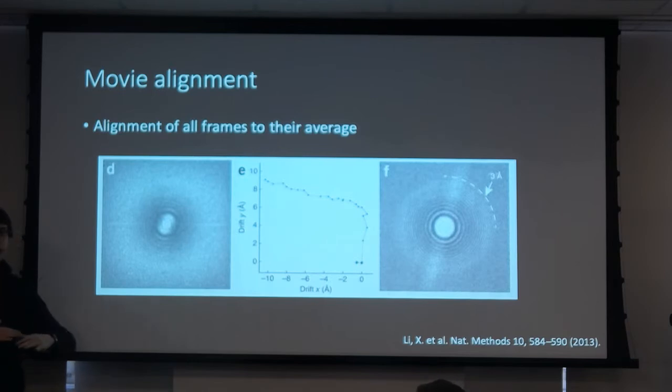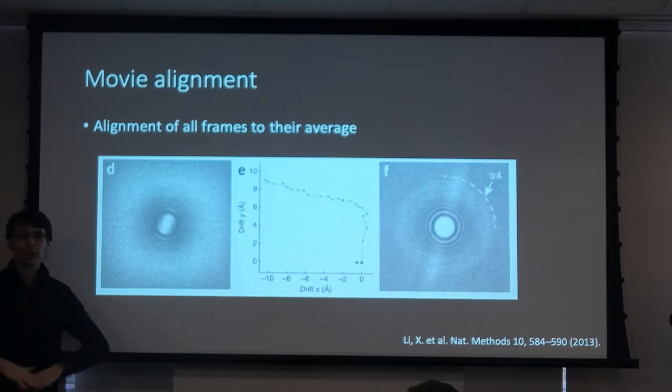This rapid doming is a pretty large movement in the z direction, which you don't really see if your image is flat, but which makes different parts of your image move in X and Y direction as well. So it's kind of an expansion like this.